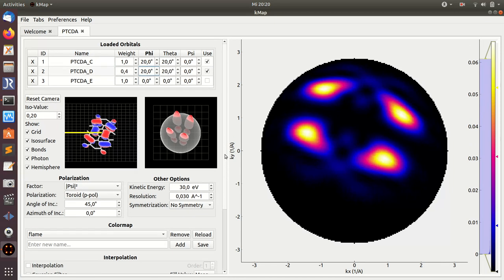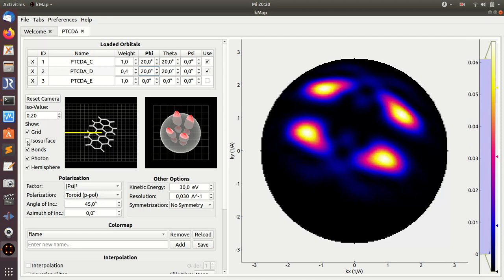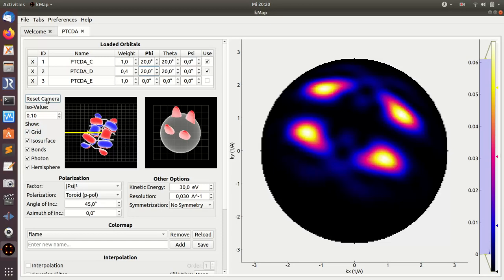What else can you do on this orbital data tab? For these preview images, you can switch on or off the isosurface in real space. You can also change the isosurface value if you like. You can show or not show the bonds of the molecule. You can also switch on and off the photon direction.